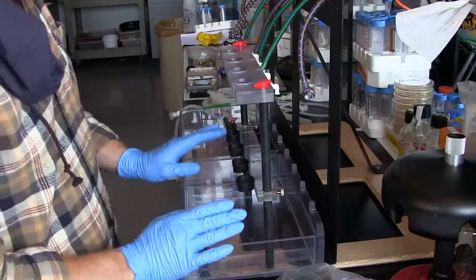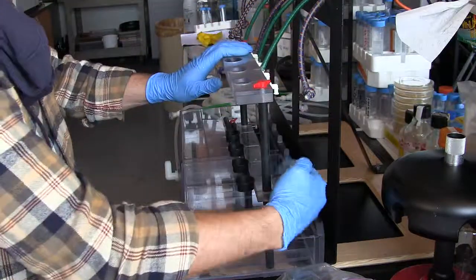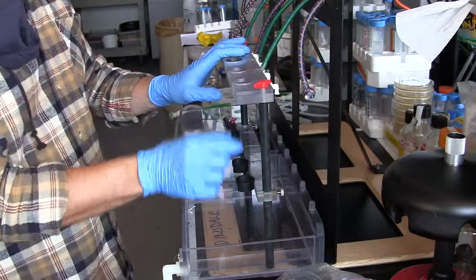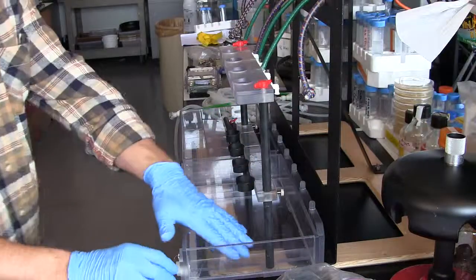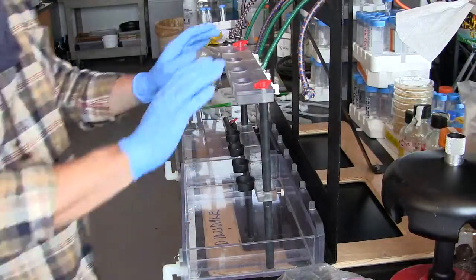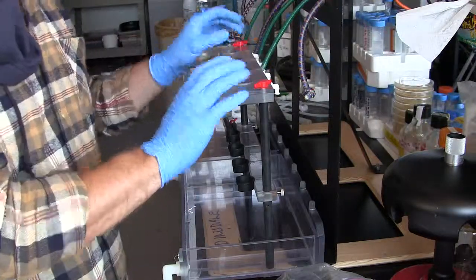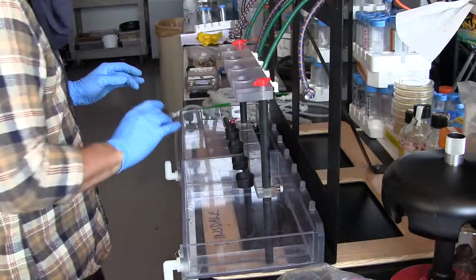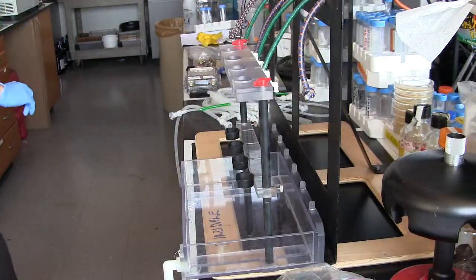Okay, the rationale behind this is that when we run our water chemistry set, water will be flowing through tubes into here and then running out here through the filter holder. The water then gets captured in the sample holders and it fills up in here and then drains out. These holes here are for lids to be placed, so when you're on a ship and it's moving back and forth, you don't lose the lids everywhere. That's really awesome.